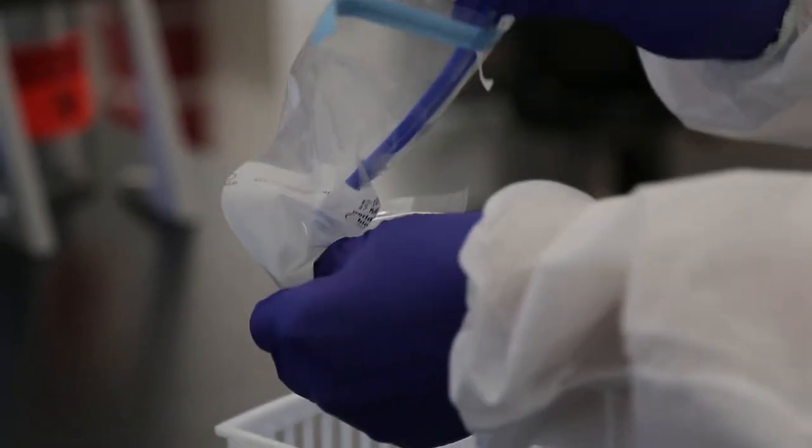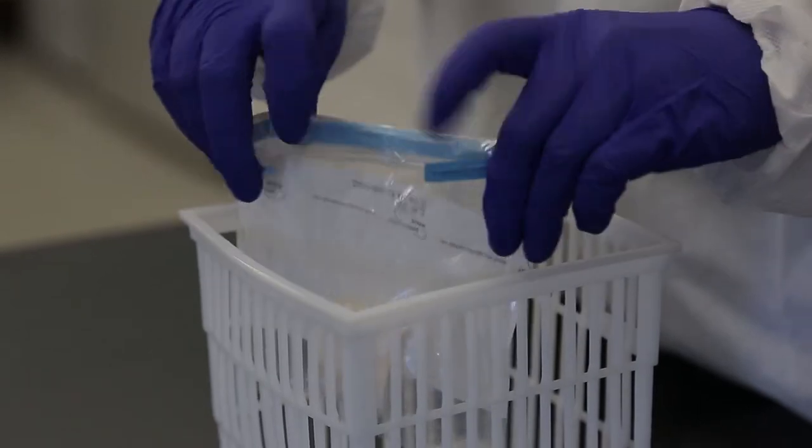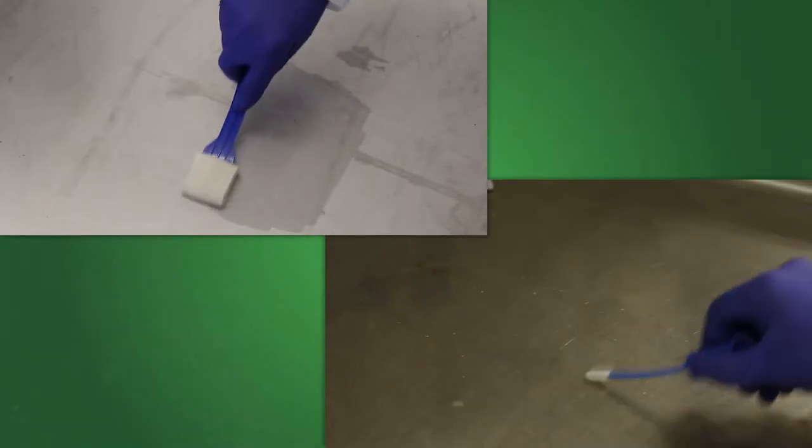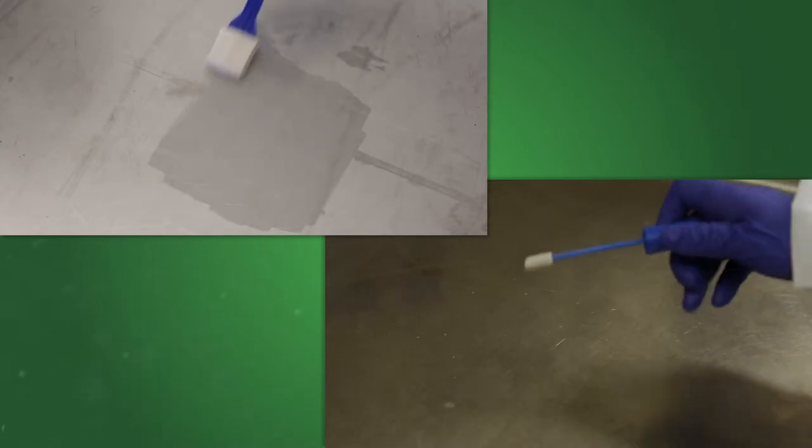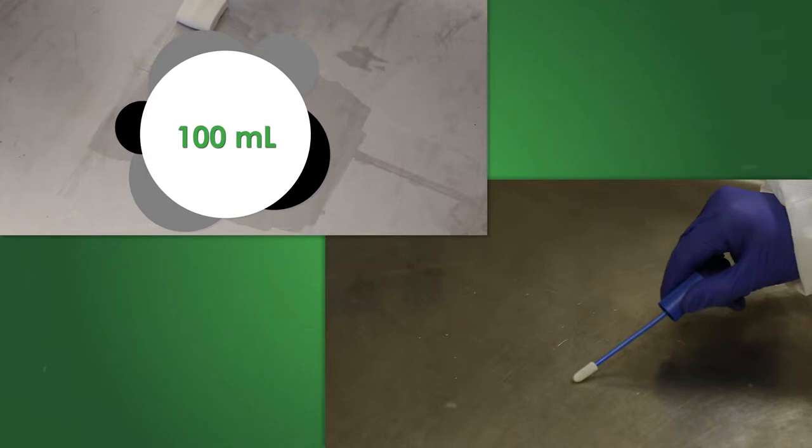Place the sample back into a sterile stomacher bag and close up as shown. Label the bag appropriately. Collect the rest of your environmental samples in the same manner. For sponges, 100 milliliters of media is recommended.